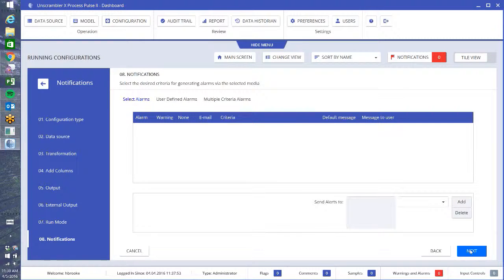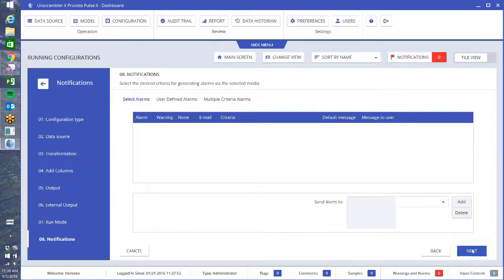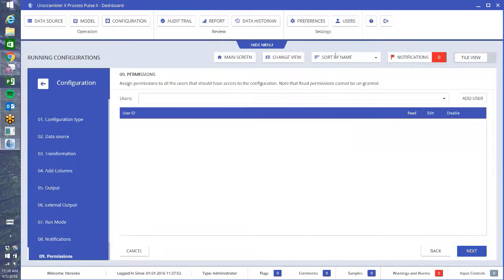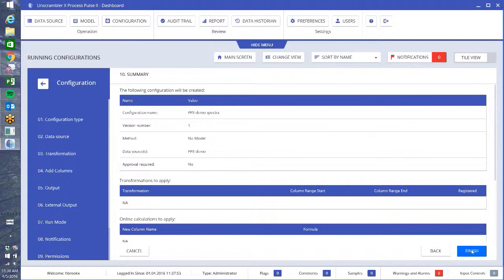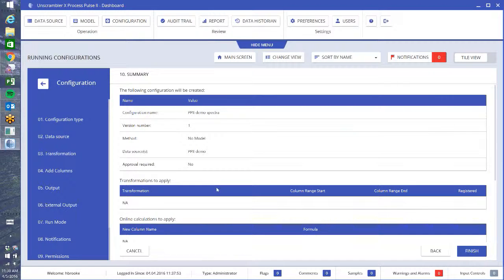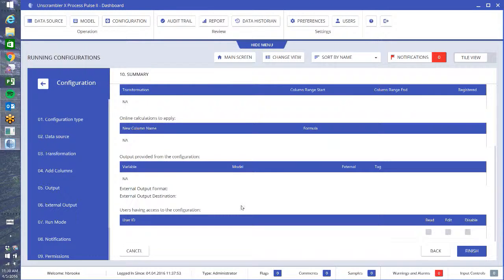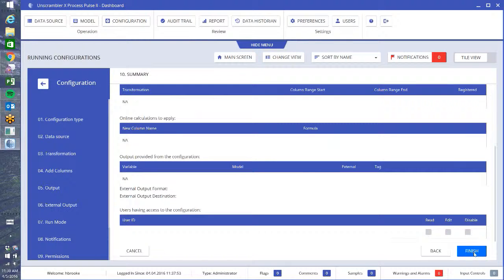You can set alarms if you want to as well. Next, again you can assign users that have access to read and write or disable the models or configurations. This is just your general overview again, this was no model and I can check them all, everything looks good, so I'm going to do finish.